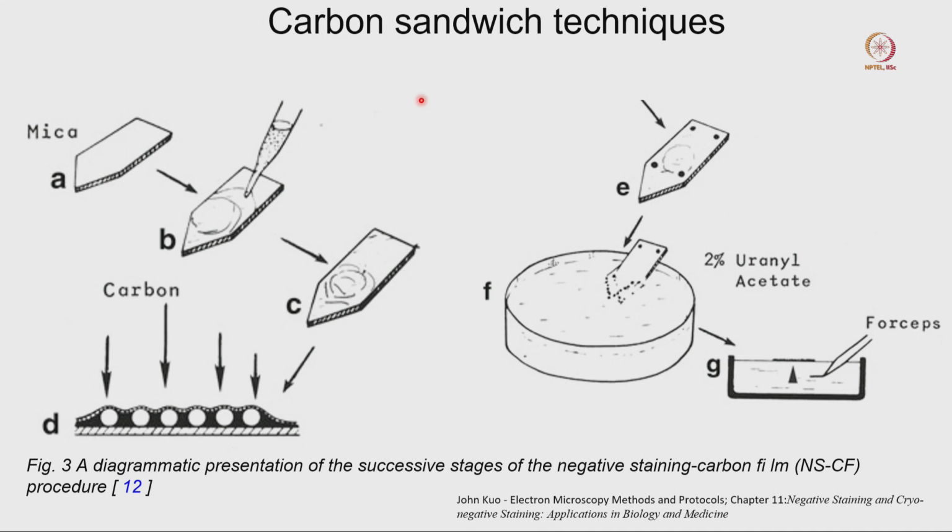Gradually, from 1990, 1995, cryo-EM became a very popular technique. People can freeze the sample at physiological condition and image the sample at physiological condition, and that is the time researchers and scientists moved towards cryo-EM, and this technique gradually stopped being used by researchers.